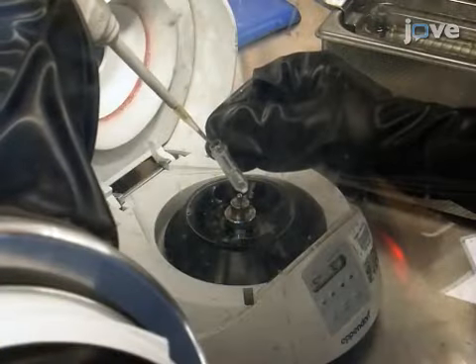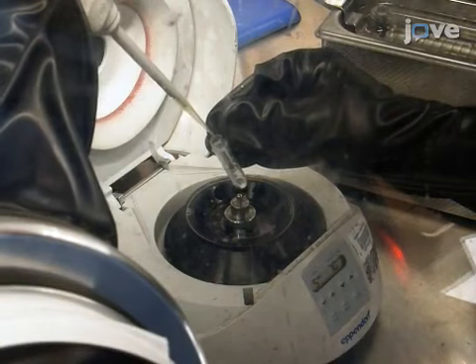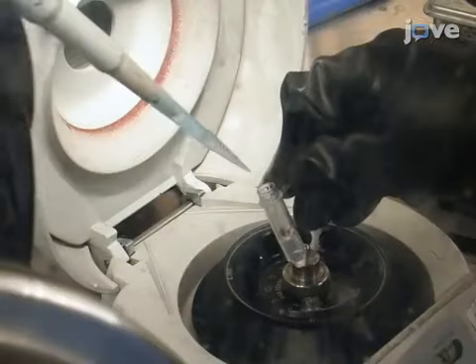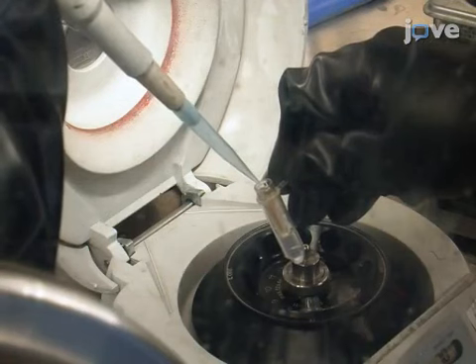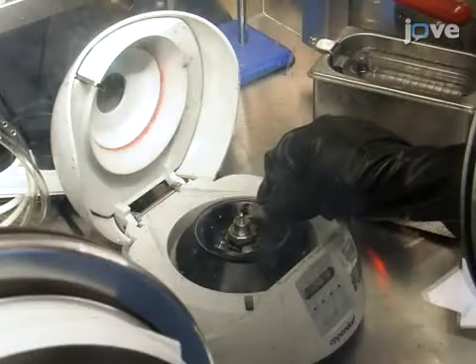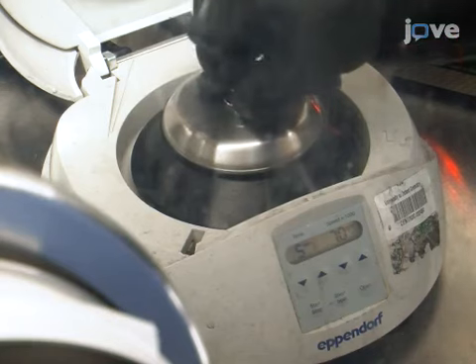Then, load 50 µL of an approximately 7 mg per mL solution of E. coli hydrogenase 1 into a 50 kD centrifugal filter unit. Dilute the solution with 450 µL of a low ionic strength exchange buffer with a pH close to the isoelectric point of the hydrogenase. Concentrate the mixture to 50 µL by centrifugation at 2,700 times G.